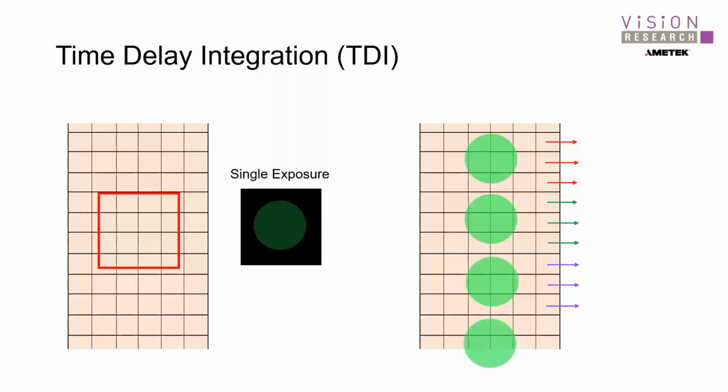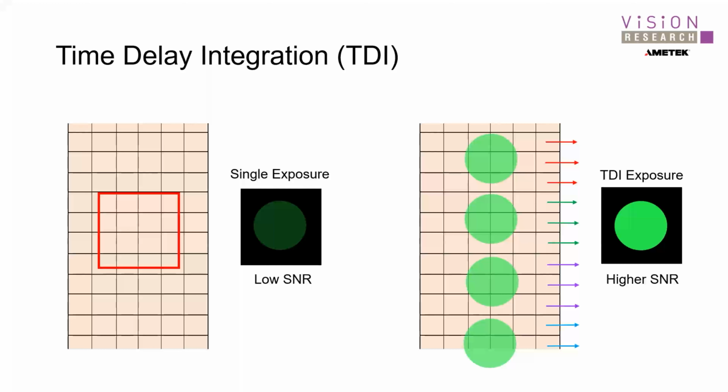Now you have essentially the same image at different regions of the sensor that get read off at different, delayed periods of time. There's some other magic that makes sure the readout is optimal for the speed of the cell and also the size of the cell. But what that allows you to do is get higher signal to noise ratio, because you can essentially average these images.